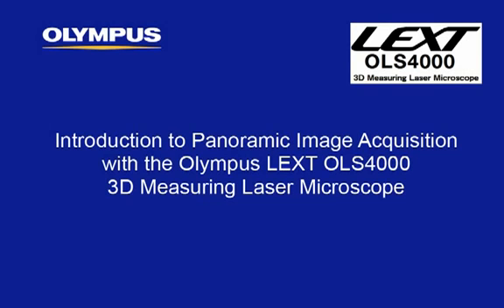This tutorial will provide you with detailed instructions on getting started with panoramic image acquisition with the Olympus LEXT OLS4000 3D measuring laser microscope.